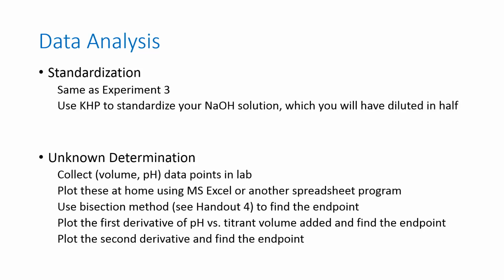What's in your bottle now should have a concentration written on it from experiment 3. It's about 0.1 molar. For this experiment, you need 0.05 molar. So before you standardize it, you'll need to dilute it in half. That's why we're standardizing it again.